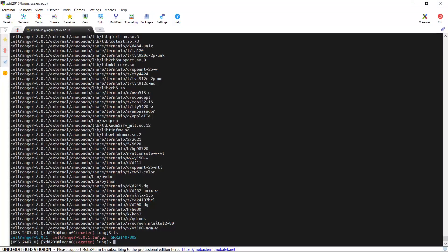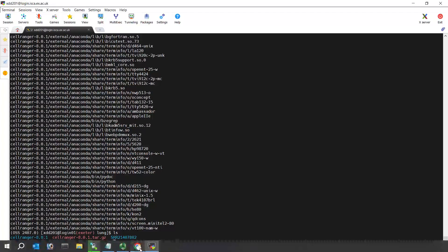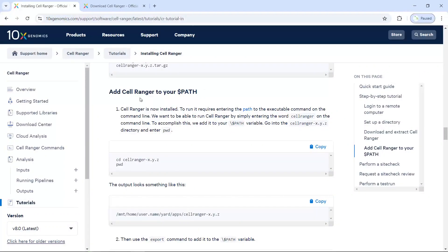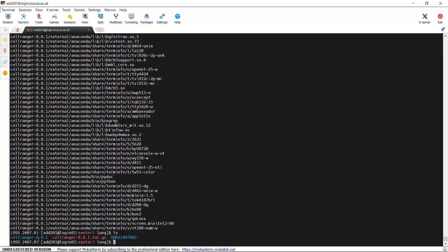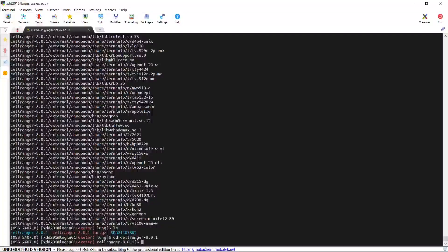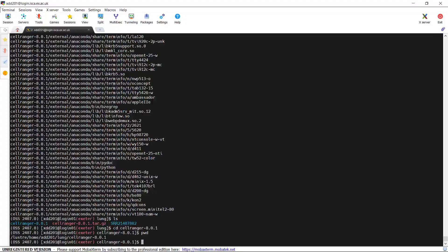So we have installed the CellRanger software. If we look at the guidance from the 10x Genomics website, the next step is to add CellRanger to our PATH. We change our directory to the CellRanger folder. The page is still showing the old version, but we are using 8.0.1. We go into that folder and use the pwd function to find the full file directory path for the CellRanger software.